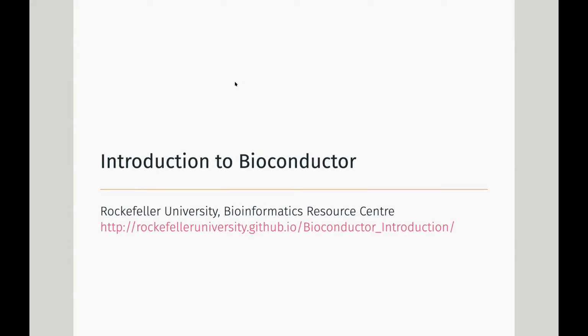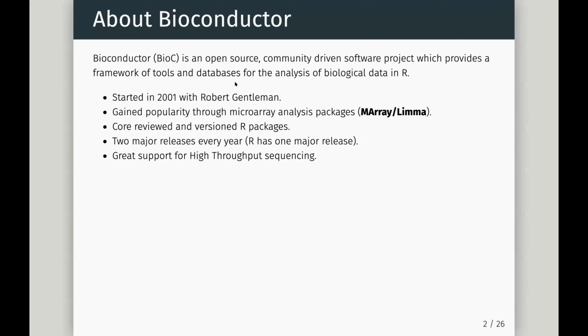Because Bioconductor really is a consortium which has changed the ways we can interact with data, particularly genomics data. So this is the introduction to Bioconductor. Bioconductor, often shortened to BioC, is an open source, and it's important that it's open source, we know exactly all the code in there, community-driven software project.